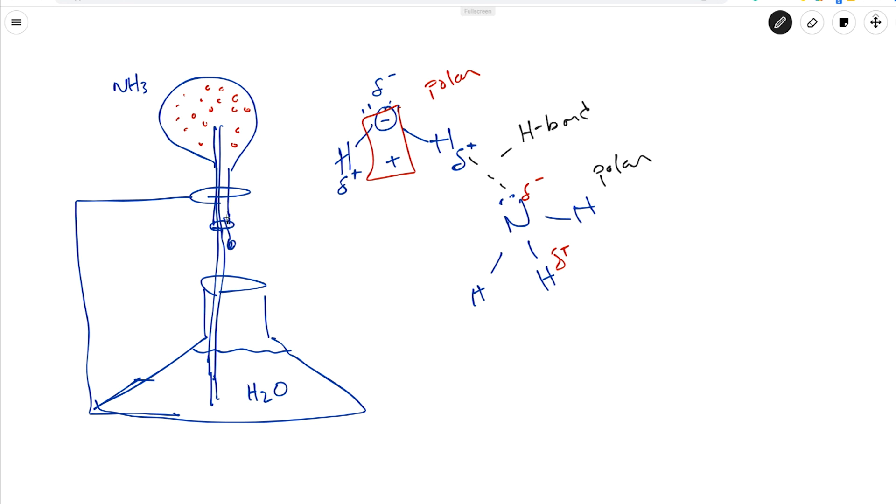And so when the ammonia - once you squirt the water into the flask, the ammonia and the water, they love each other, and they start dissolving. But when they start to dissolve, what happens is you keep having less and less ammonia. Boom, all these start disappearing.